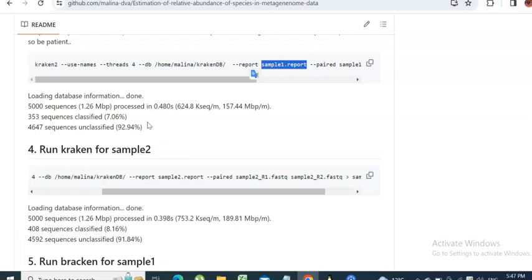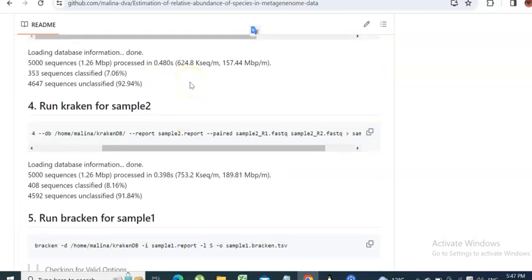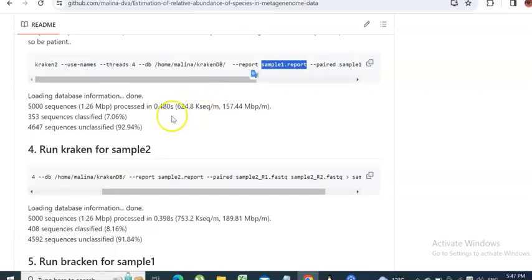This is very likely because our database is only 8 GB. The second reason is a problem with sequencing quality, which is probably not the case because this is in silico generated data. The third reason is the presence of adapters. These are the possible reasons for the low number of reads that are identified with some classification in the taxonomic tree.